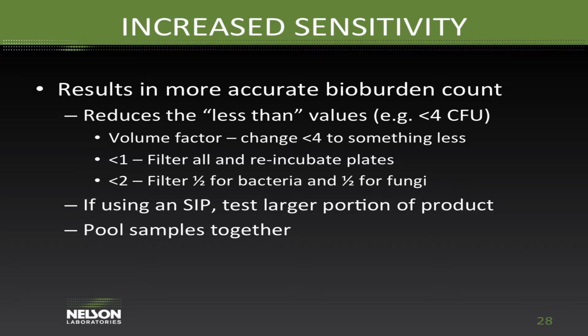When your bioburden tends to be lower, then it will be better if you have a more sensitive bioburden test. A few ways that we do that, because we don't want to see less than 4s. If you're getting a lot of less than 4s, then you really should have a more sensitive bioburden test. Less than 1, less than 2, that makes more sense. So a few ways that we do that.